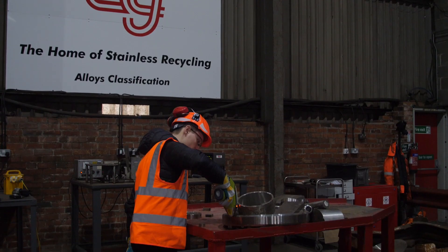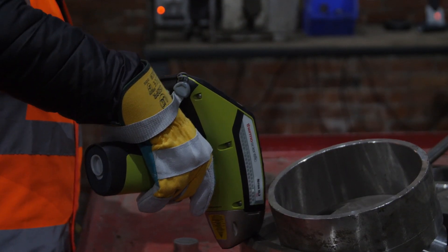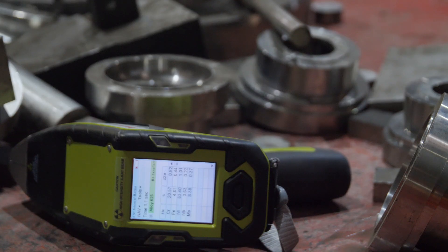Using a clean prepared surface of the metal, a Niton analyzer gun can give us an accurate reading on elements like 304, 316, chrome iron within a matter of seconds. Holding the Niton analyzer down for a further few seconds can give us much more accurate analysis.